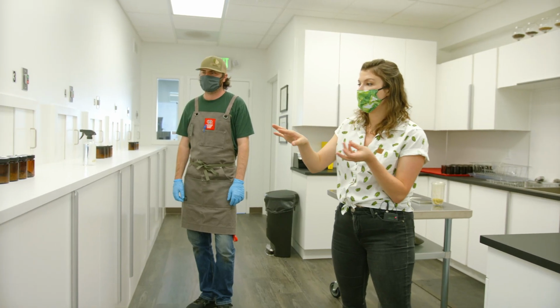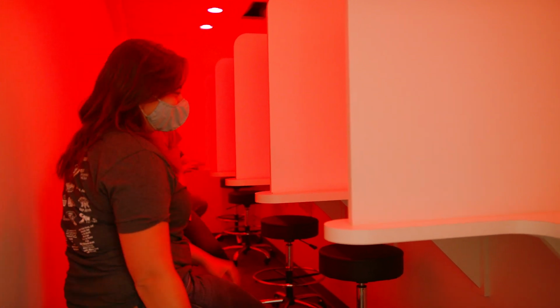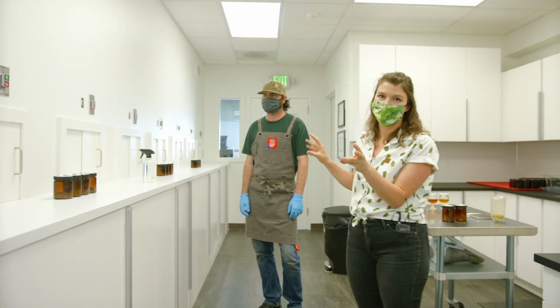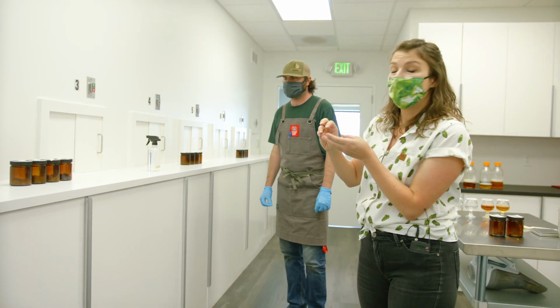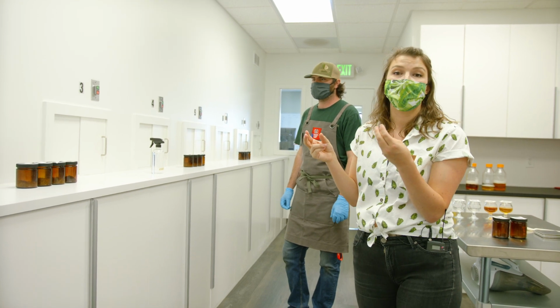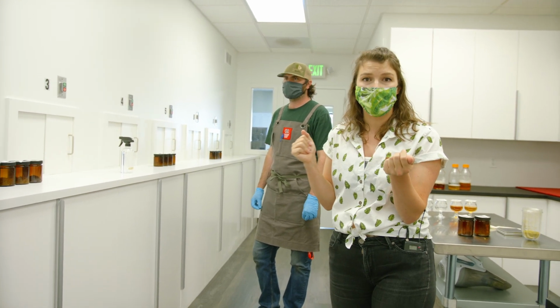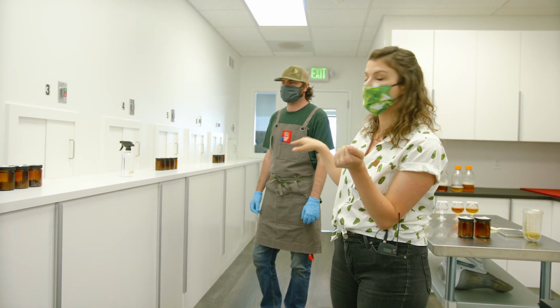Right now, Kevin set up the samples in front of the booths where each panelist is going to be sitting. So we have a panelist in 2, 4, and 6. As you can probably tell, we're trying to be careful with COVID-19, so we're spacing the panelists out. We're only allowing 3 back in that room at a time. So we have individual sample sets for each panelist, and they are going to be completely randomized, so every panelist will assess the samples in a different order, and that's been predetermined. They're already set up that way.